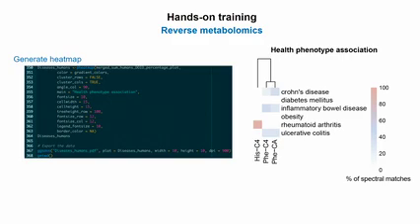But how many of you so far got to the last heat map? Oh, that's good. Okay. You still have a question over there on the left? Do you have a question?